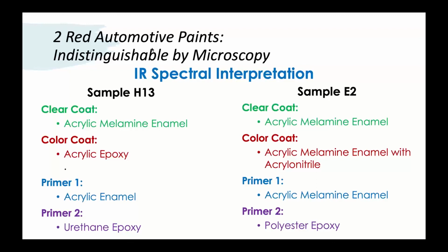Because we can still do the manual spectral interpretation on O-PTIR spectra, and we can do that because O-PTIR spectra look exactly the same as transmission spectra, so there's no correction needed, it really would work seamlessly with the PDQ as it stands now. Future developments of the PDQ, I believe, are planning on creating a searchable database for analysis, and I think that Photothermal would potentially have to work with them in terms of how exactly that would be done. But the IR spectra from O-PTIR are the same in quality and peak locations and heights, so I don't think it would be a hindrance to use that database.